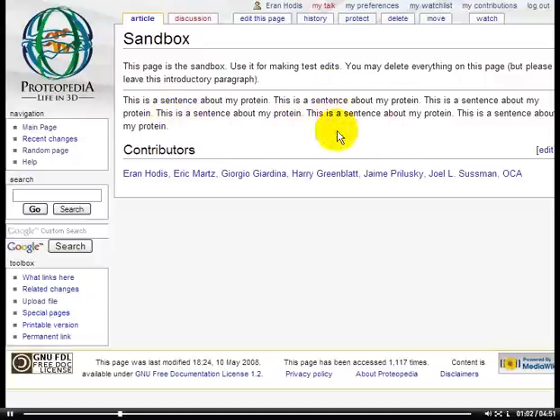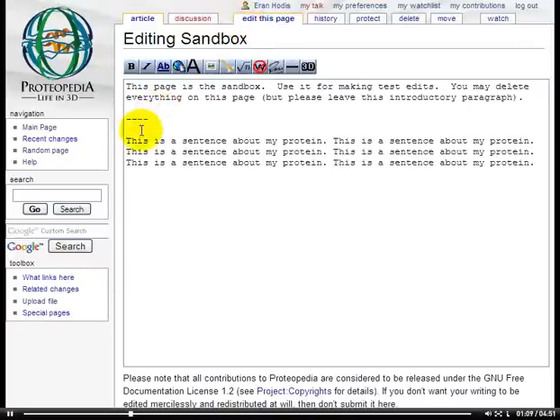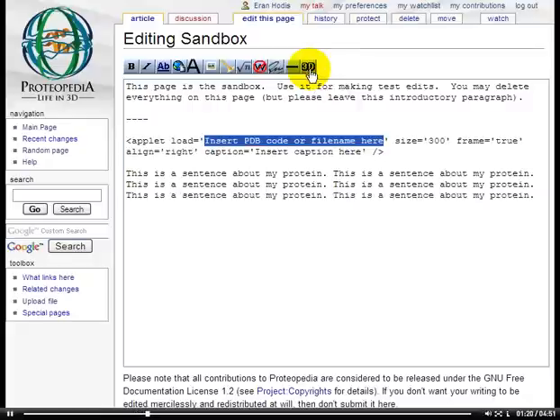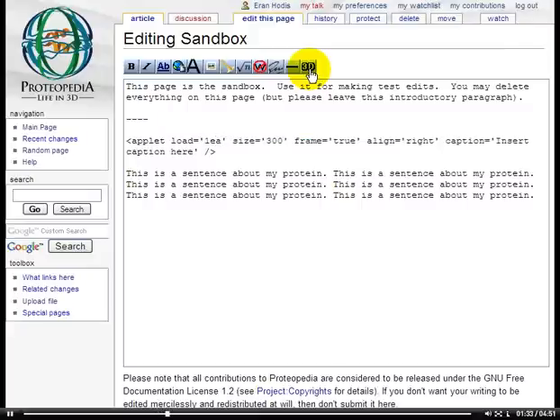We want to add an applet right aligned right here in the page. We go to edit this page, and we can place our applet above the text. There's a button here called 3D. When clicked, it adds the wiki text for a 3D applet. We can click it like this, and we see that it prompts us to insert the PDB code or the file name of a file that we've uploaded in Proteopedia into this parameter. So I'll add 1EA5.